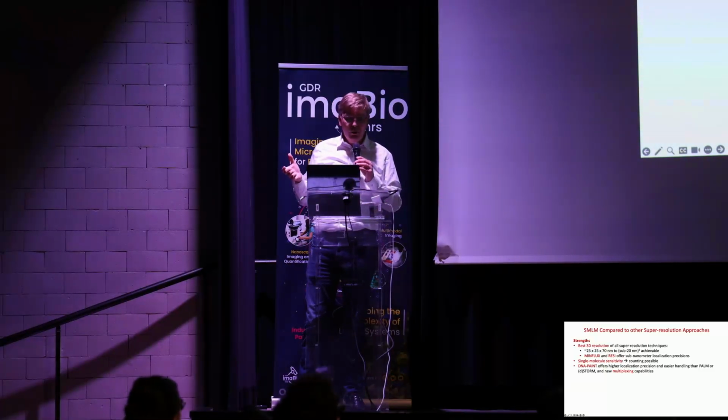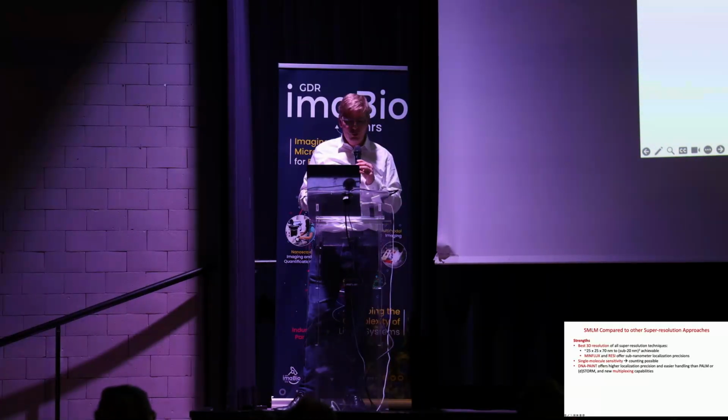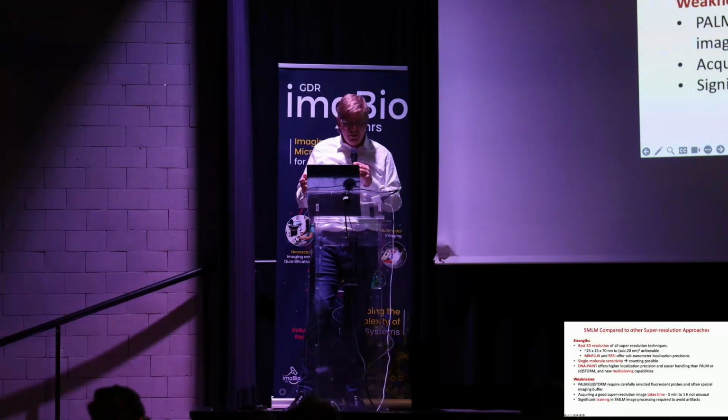It is a single molecule technique, so you can technically count single molecules. I didn't go into it. It's not as easy as it sounds, but it's doable. And the multiplexing approaches with DNA-PAINT are really quite promising.